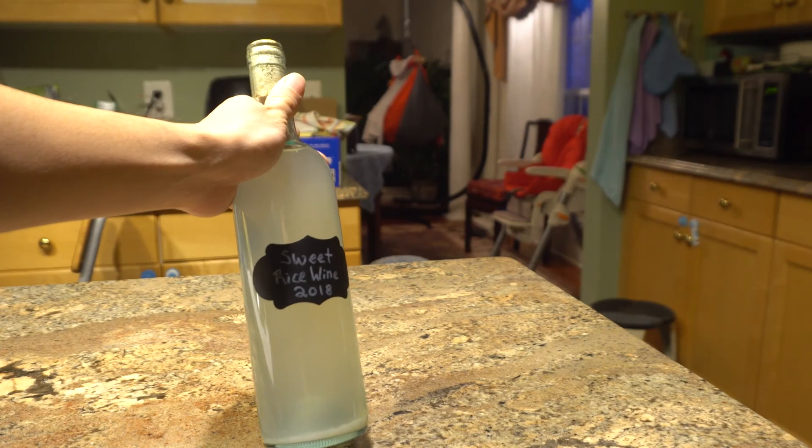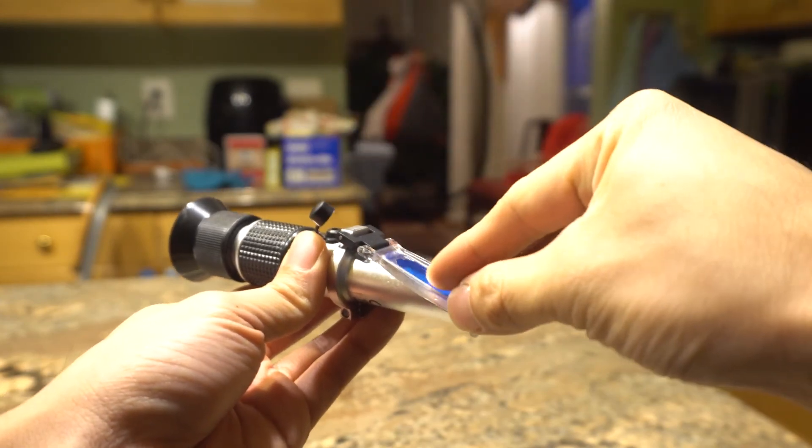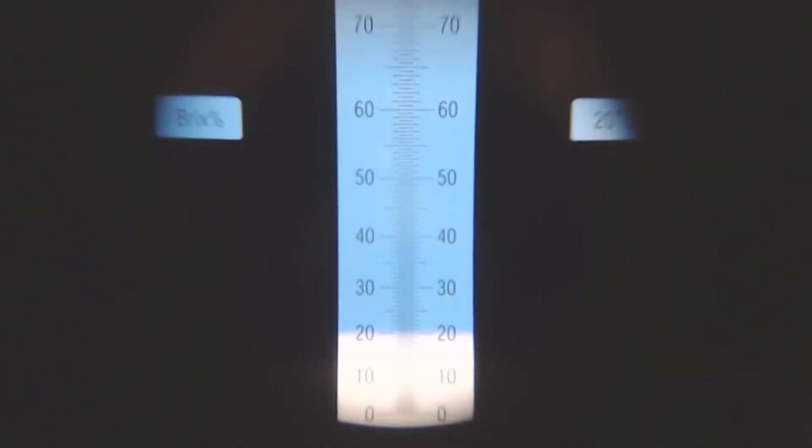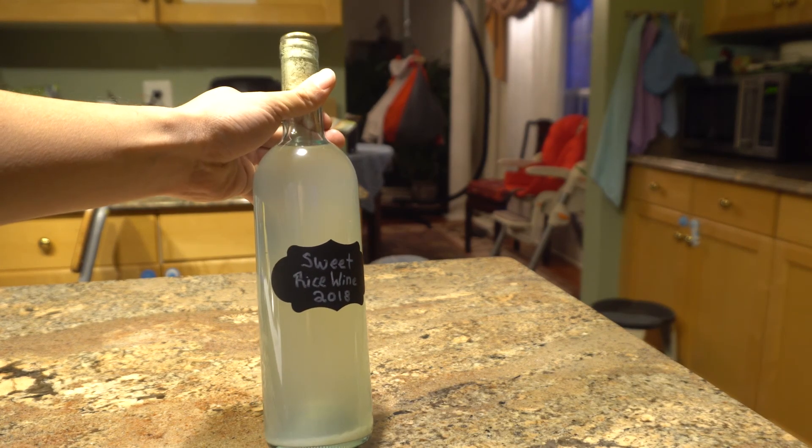Okay, so let's try measuring the sugar content of something, for example, this batch of sweet rice wine that I just finished fermenting. Here, the refractometer reads 20 Brix. Using an alcohol by volume estimator formula for rice wine, I can determine that this brew has an alcohol content of about 8.8% and is plenty sweet like a dessert wine.